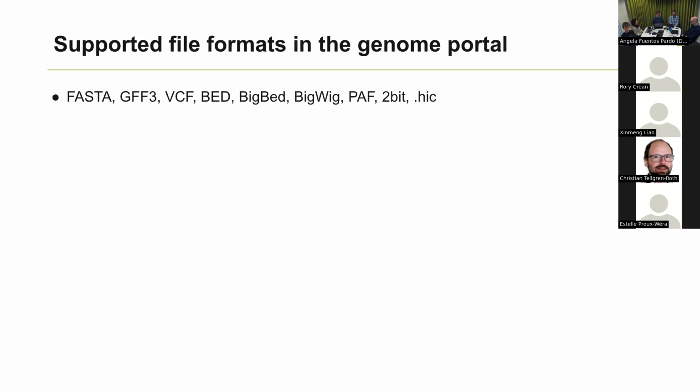For those of you in the audience who are more bioinformatically inclined, who want to know about file formats, we can say that JBrowse can support all the standard file formats. Here is a list that we picked of some common ones. There are even more than this. I think these will satisfy most needs. Most bioinformatic pipelines and tools will output in these formats or similar. We've actually been playing with similar formats as well, and we can get into display. It all again depends on your needs in your research groups.